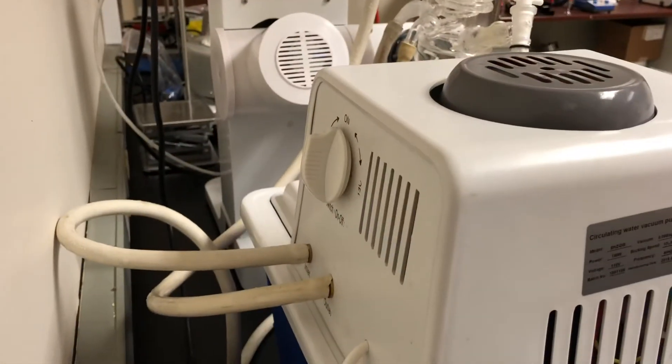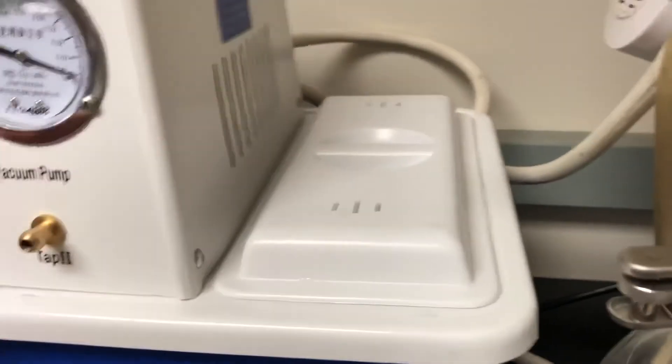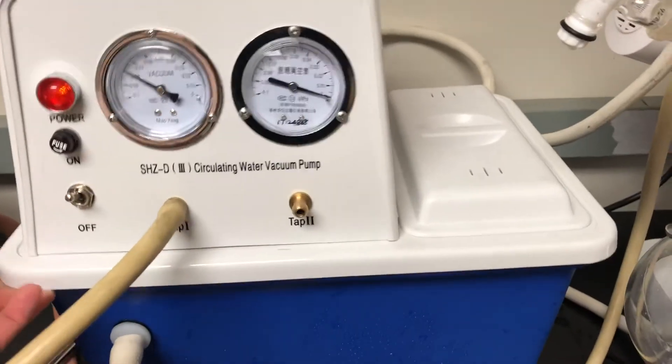Again, I'm not using it. Back side there, you got your valve and your hoses that go into it. Simply put, this system, it's literally just sitting on there. The whole thing is a lid in the sun. The whole thing will actually lift up.